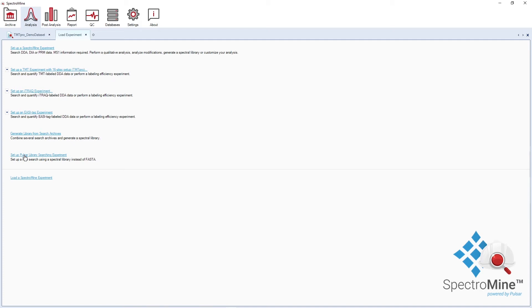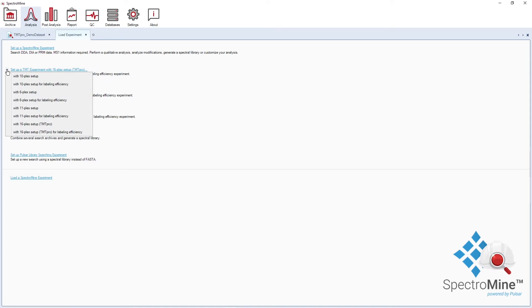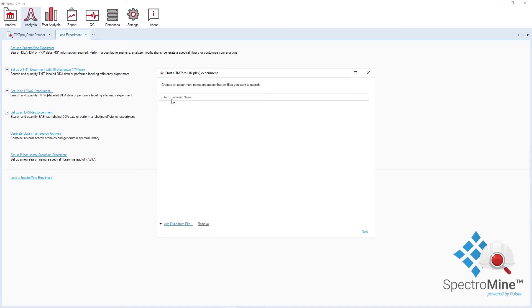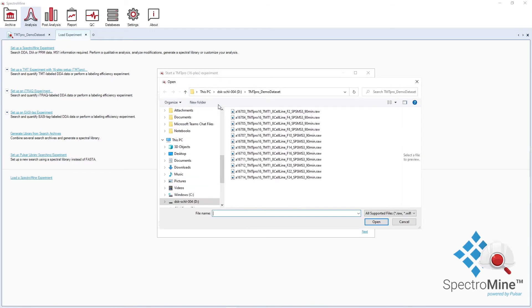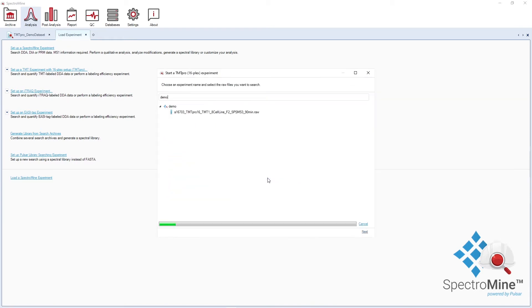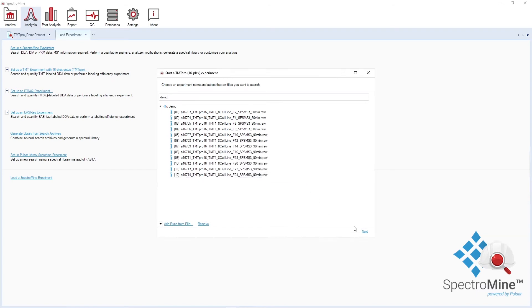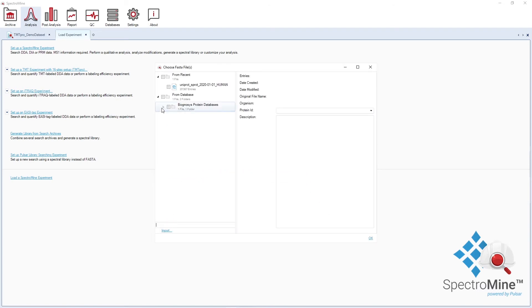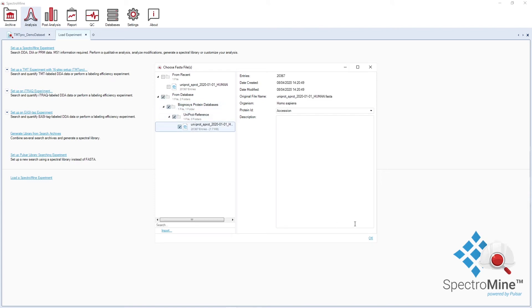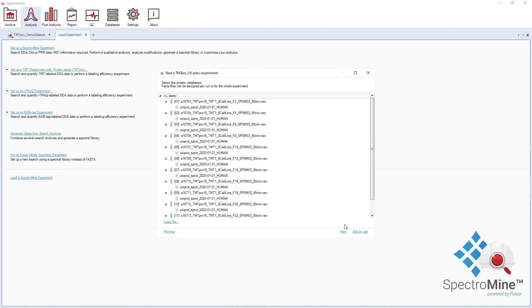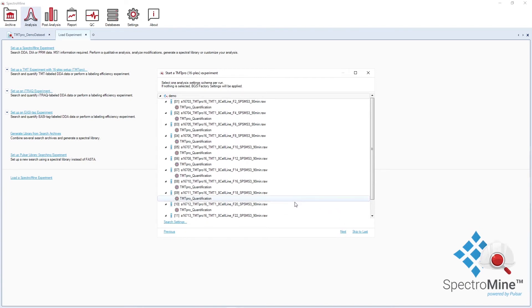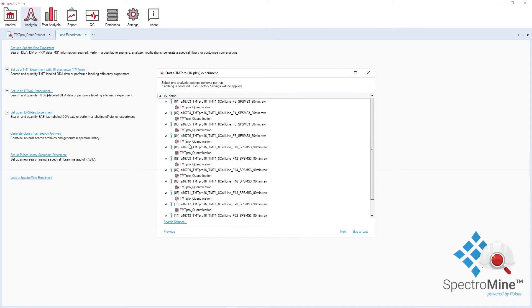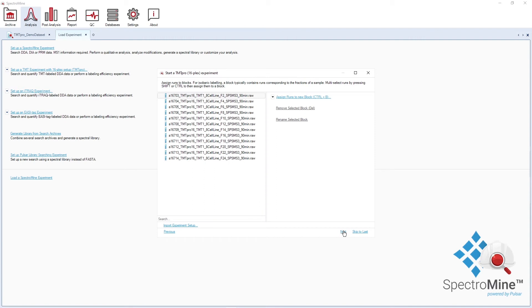My experiment is a TMT 16plex or TMT Pro. I can go to a TMT shortcut and select 16plex setup. I will first name my experiment and select the runs. I will then choose the FASTA file for the search and define the search space. Because I used a shortcut, the search settings are already set for TMT Pro quantification. If you have a block design, you can assign runs to blocks and SpectrumMine will perform cross-block normalization.